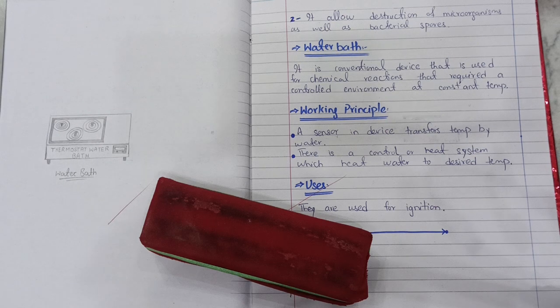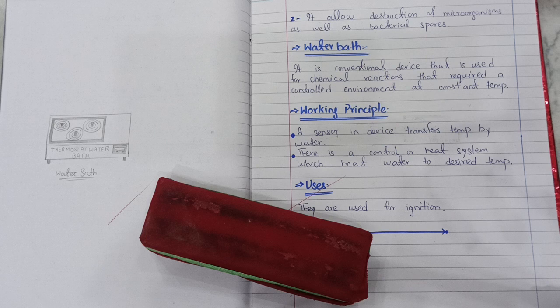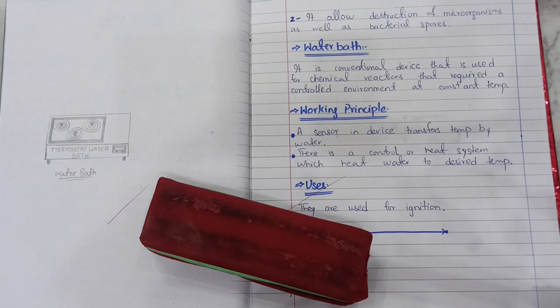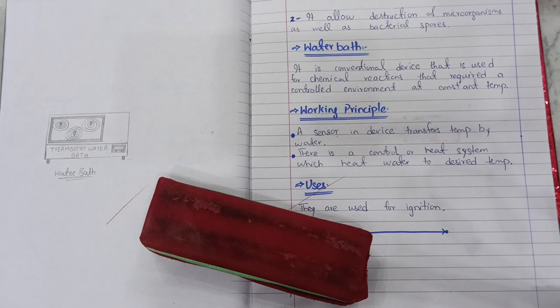सो हम लोगों ने यहाँ पर ये सारे इंस्ट्रूमेंट कवर कर लिए हैं. हम लोगों ने देखा ऑटोक्लेव क्या होता है, मॉइस्ट हीट स्टेरिलाइजेशन के लिए काम आता है, उसके कंपोनेंट्स क्या हैं, उसकी यूजेस क्या हैं, what is the working principle of it. We have discussed everything about it. Then we have discussed the incubator, we have discussed the laminar airflow, hot air oven, and lastly we have discussed the water bath.